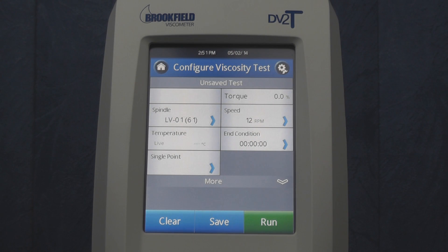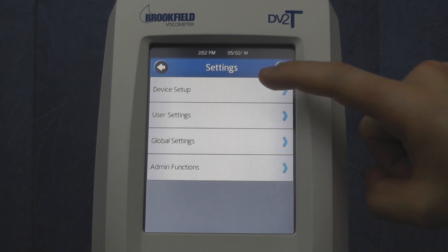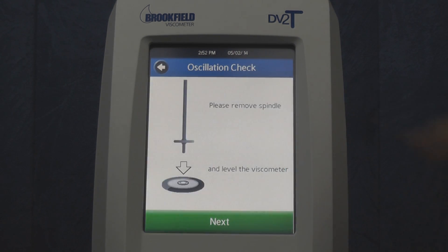To perform this test, first press the settings icon in the top right corner, go to device setup, and then oscillation check. It will ask you to remove the spindle and level the viscometer.